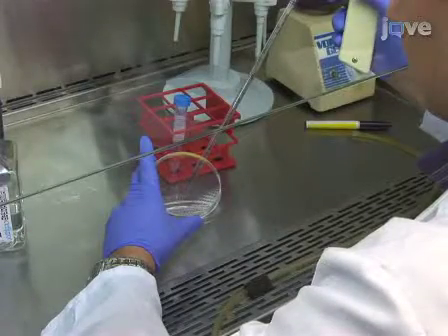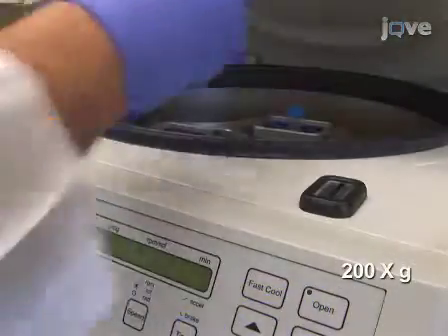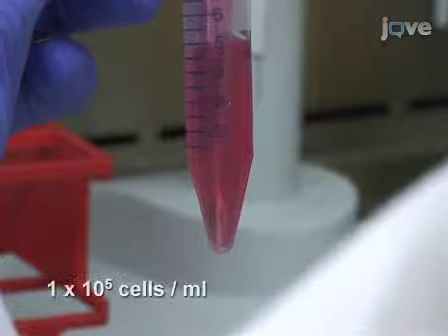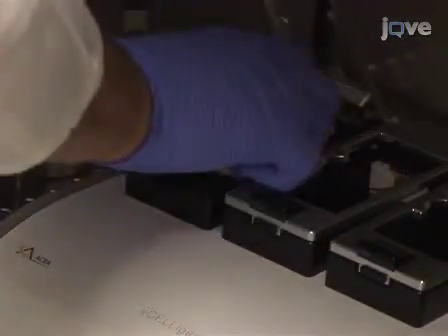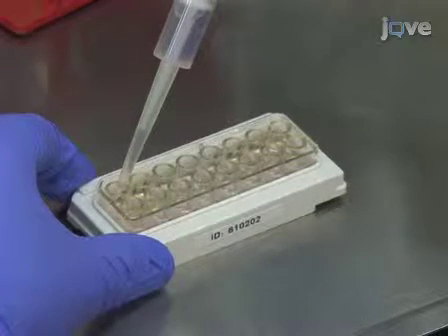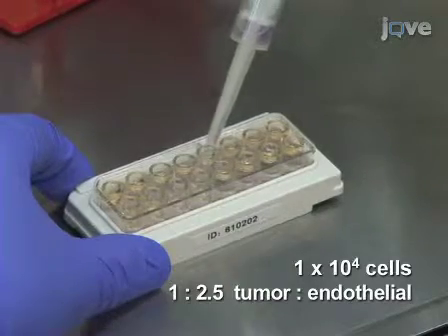In preparation for the invasion assay, prepare the invading tumor cells. Here, osteosarcoma cells are used. Begin by harvesting the cells by trypsinization. Remove all traces of trypsin by spinning the cells at 200g and washing once with PBS. Following the wash, resuspend the cells to a final density of 1 × 10⁵ cells per milliliter in the medium used to grow the tumor cells, such as RPMI or DMEM containing 10% FBS. Pause the experiment by clicking the Pause Step icon in the software window. Remove the E-plate and aspirate the EGM-2 medium from the HUVEC monolayer. Add 100 µL of tumor cell suspension containing 1 × 10⁴ cells. Generally, a ratio of 1 to 2.5 tumor cells to endothelial cells works best for the assay; however, the ratio can be optimized for individual cell lines.